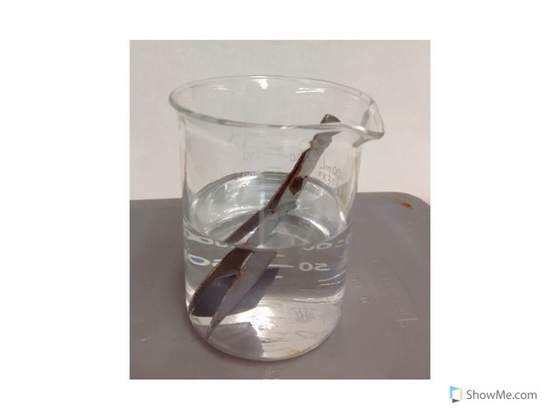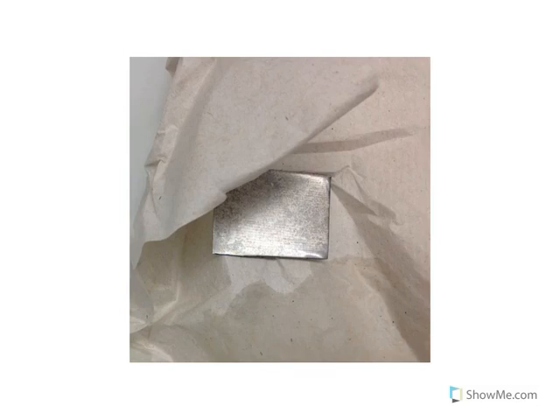Remove the metal with the forceps. Holding the metal with the forceps, rinse the metal thoroughly with tap water. Dry the piece of metal on a paper towel. When the metal is completely dry, measure and record the mass of the metal once again to the nearest one hundredth of a gram.